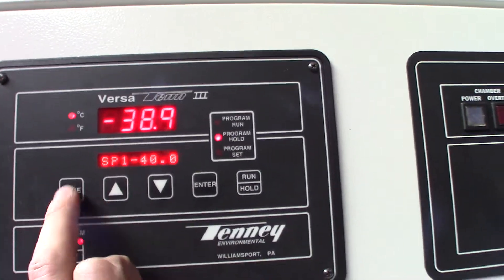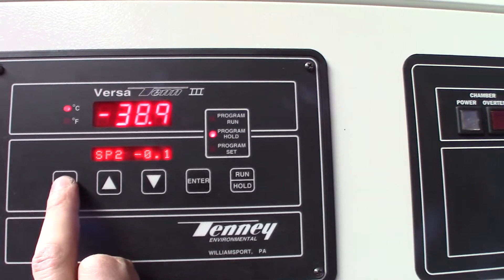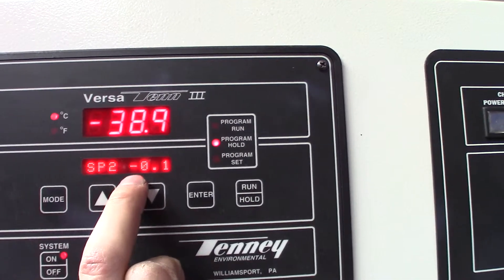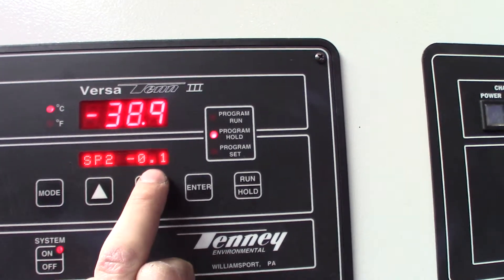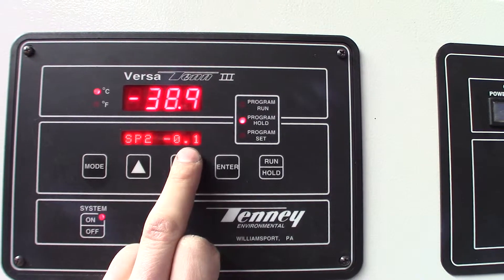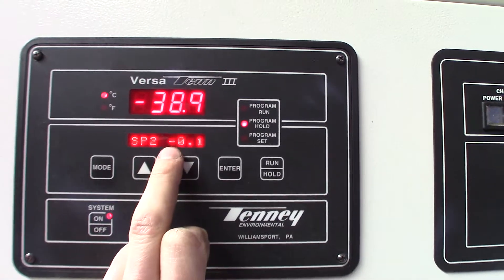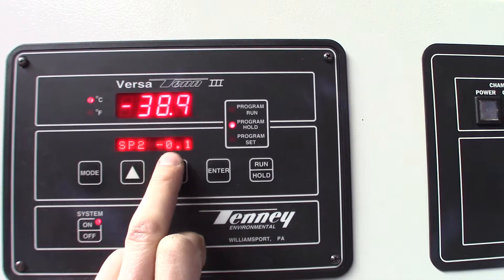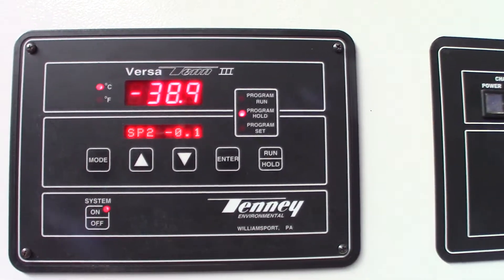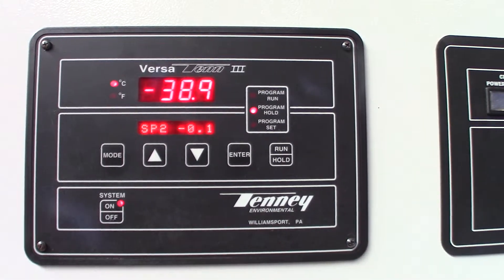You can go through the menu here. Set point two is the humidity, that's set at negative point one currently. The purpose of that setting is to turn the humidity off — as soon as this is set at negative point one, the humidity is off, as we're just running a test on the refrigeration right now.